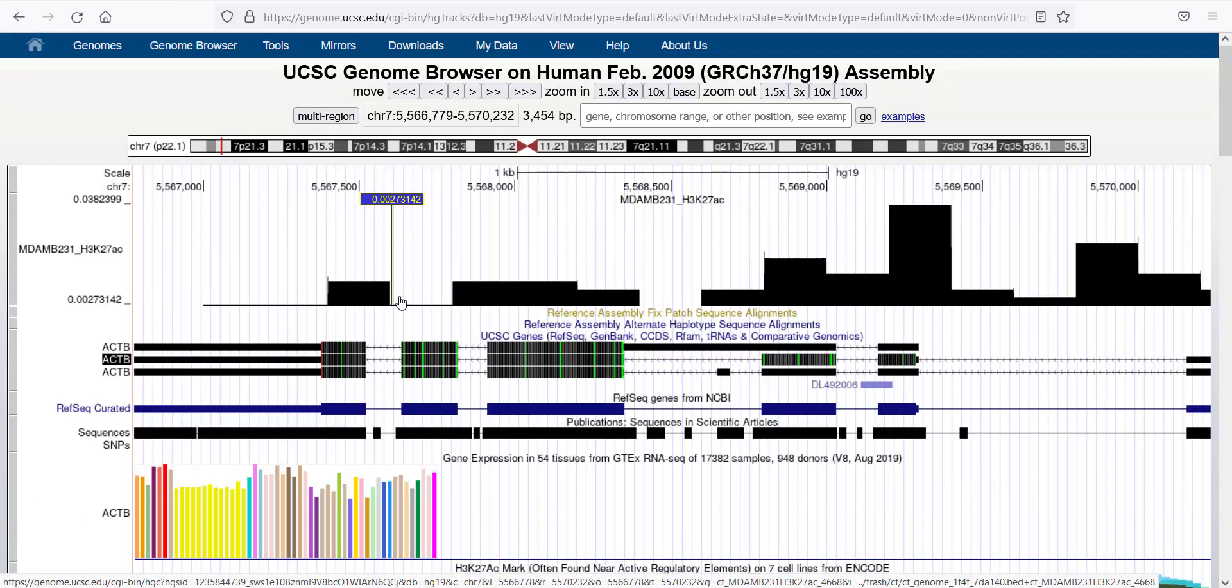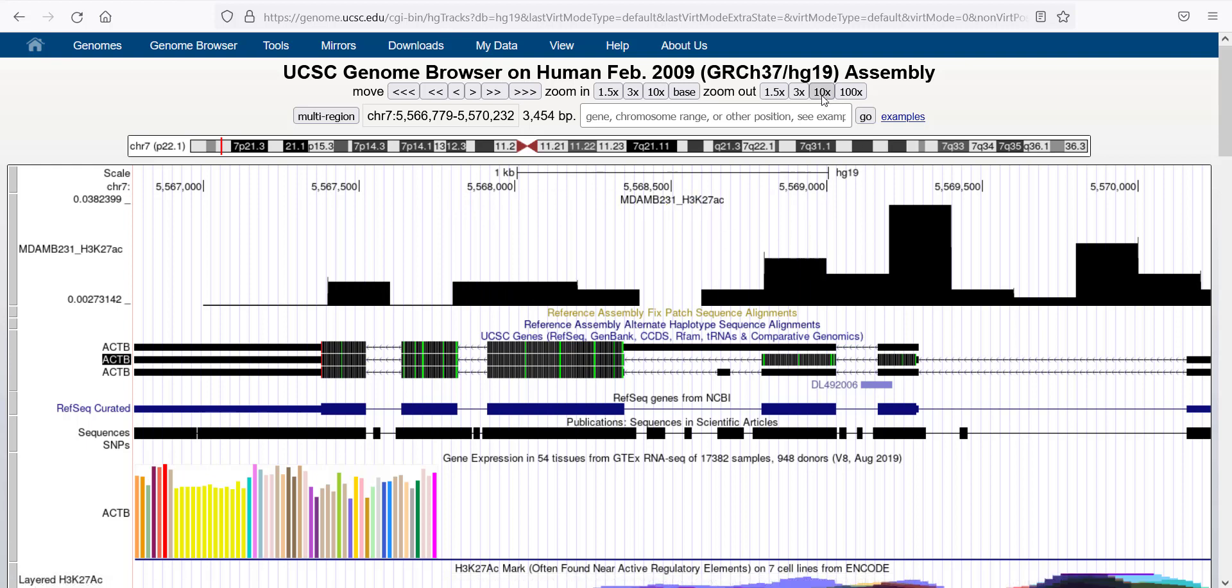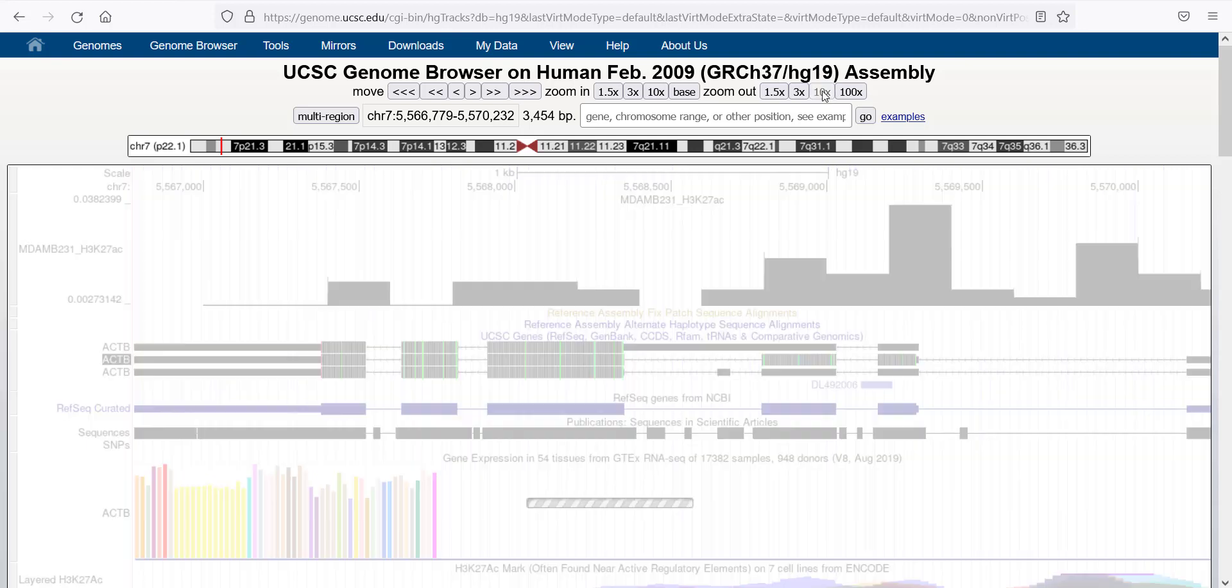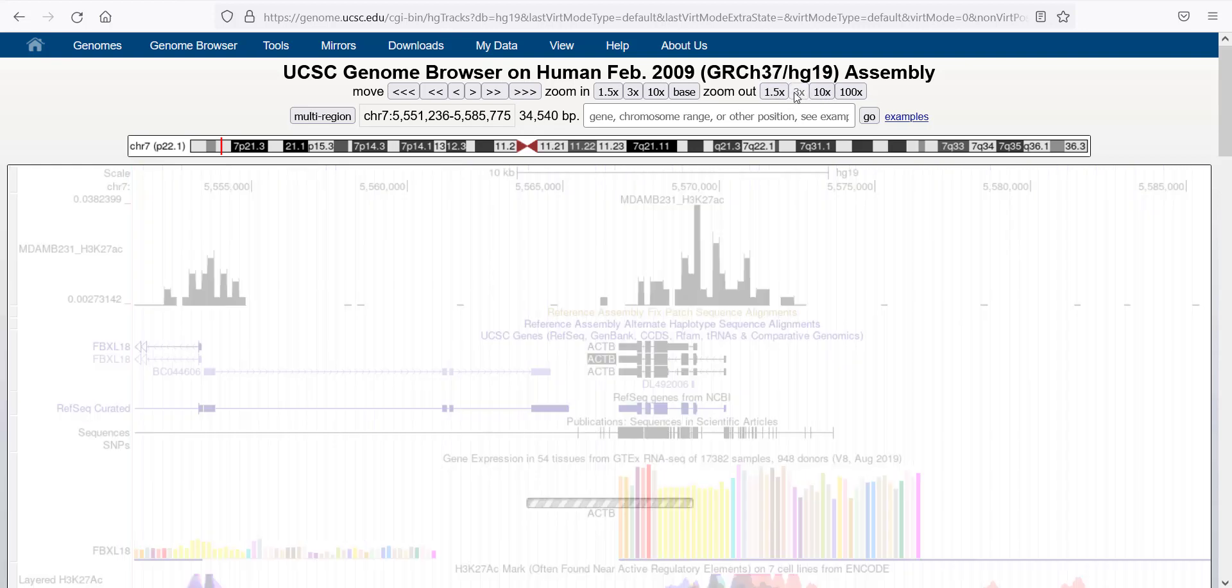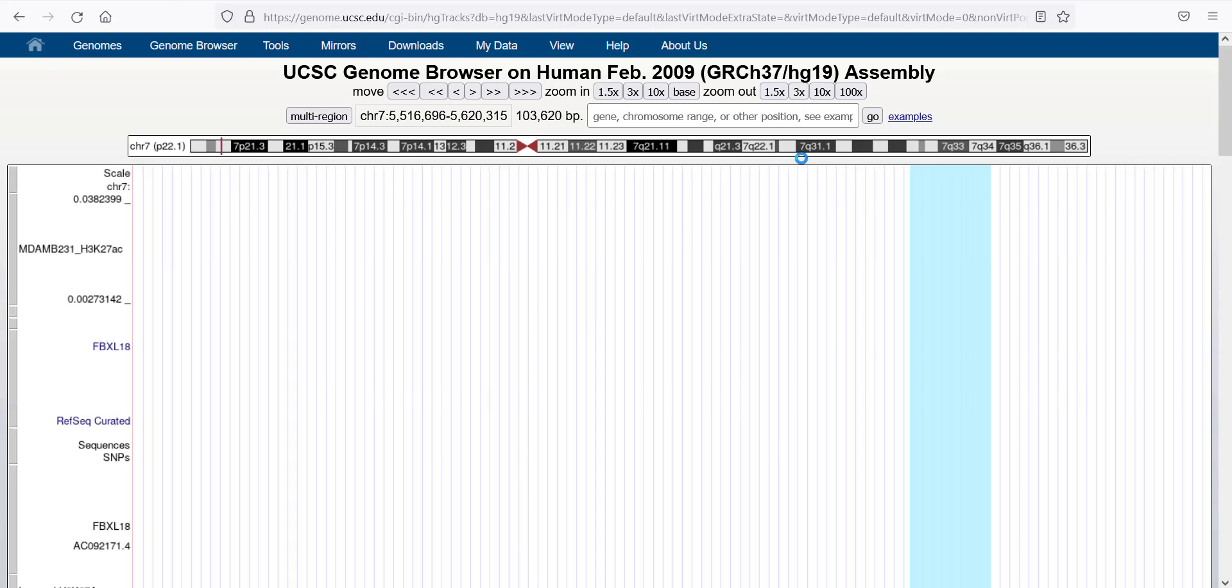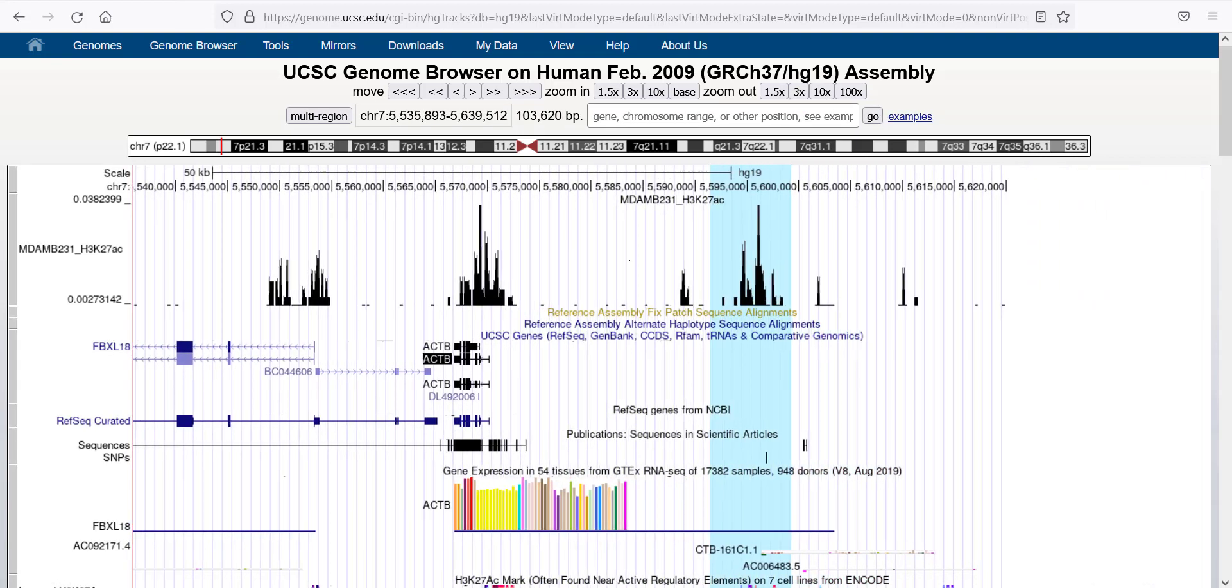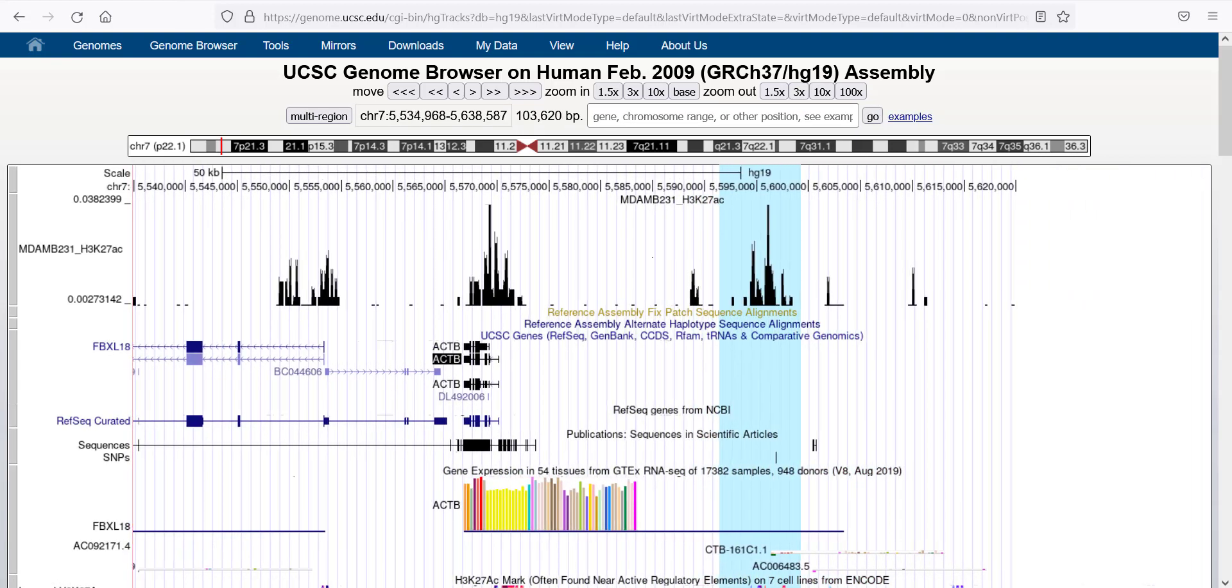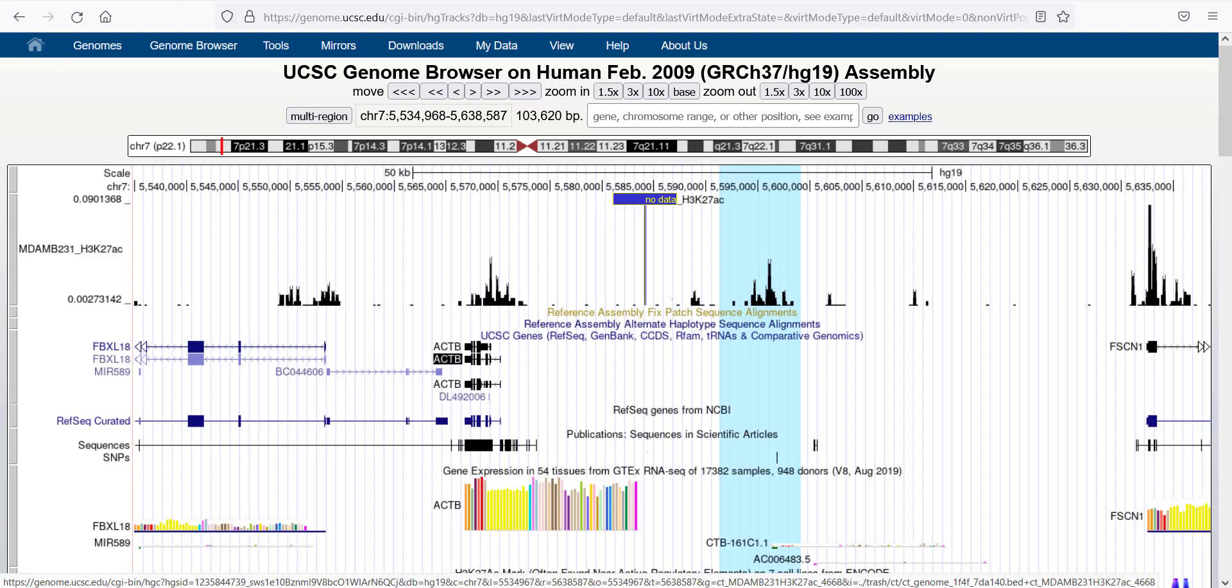Now you can see the RPPM-based normalization of this track. You can zoom out by clicking on the top here, 10x zoom out. I will do another 3x out. And then you can see here, this is a specific gene, and then this is an intergenic region in between here.